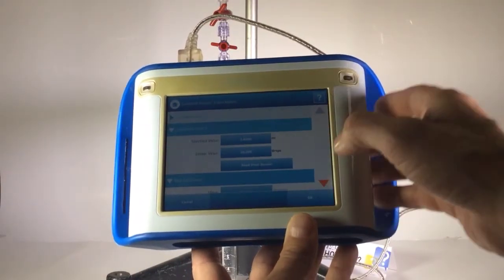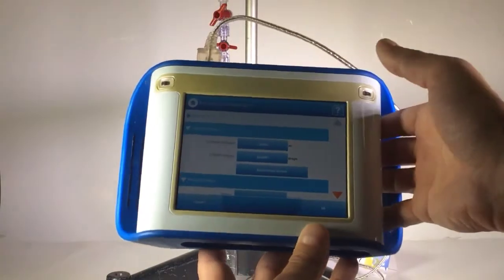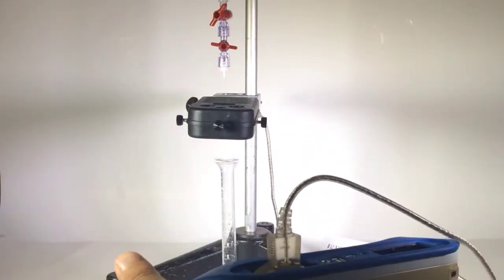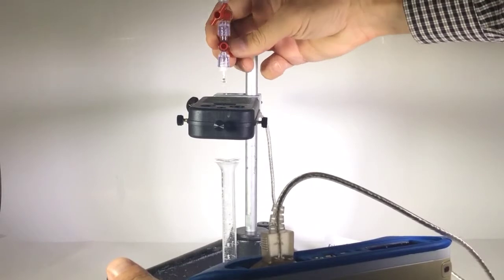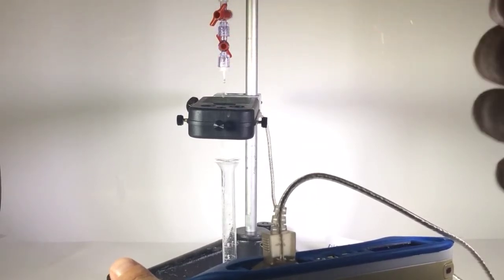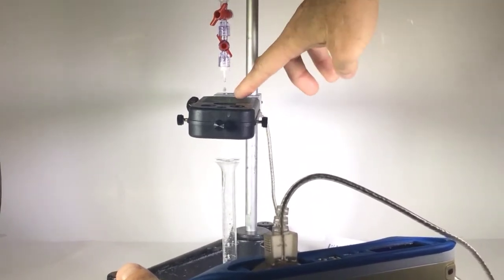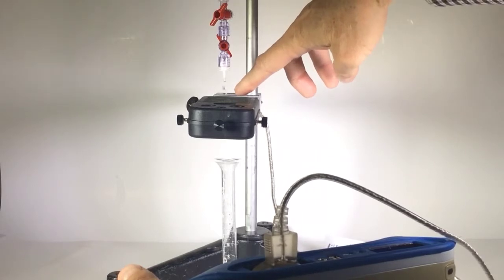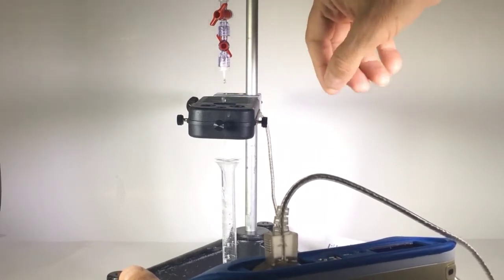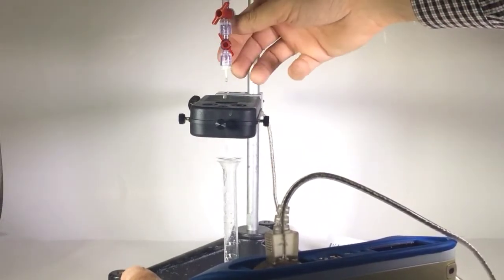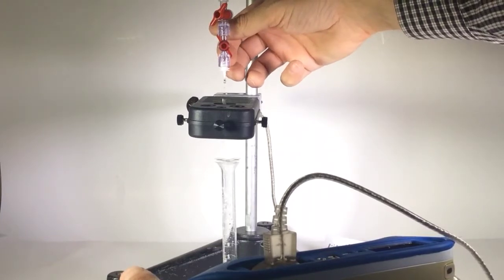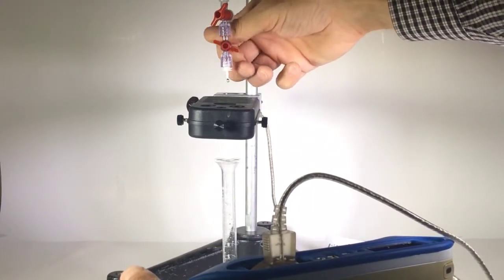So I'm going to hit next and it gives me this screen. What I'm going to do is just open this up and allow the drops to go through the drop counter. Back here I can see the light flashing. That means it is recording the drops. I'm going to let it go to about four. I'm going to stop it there.